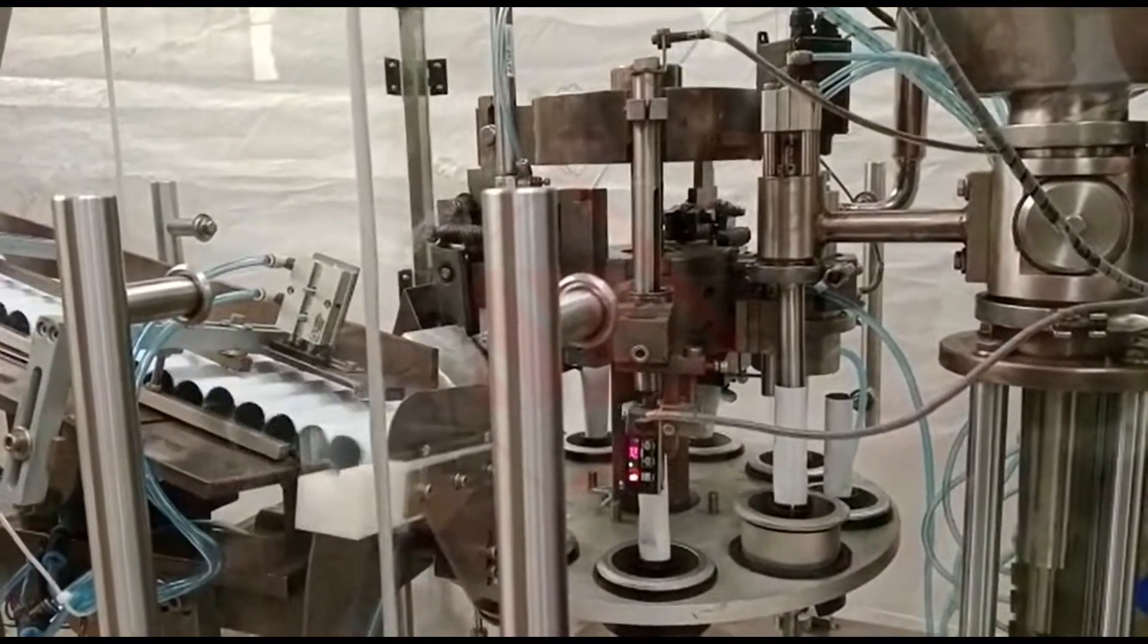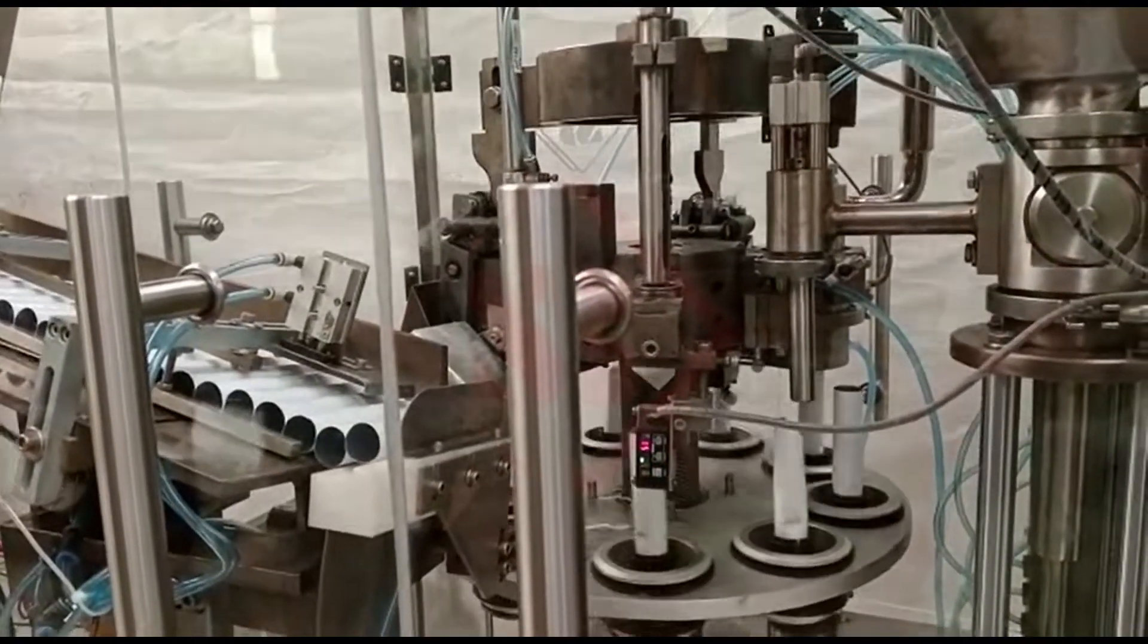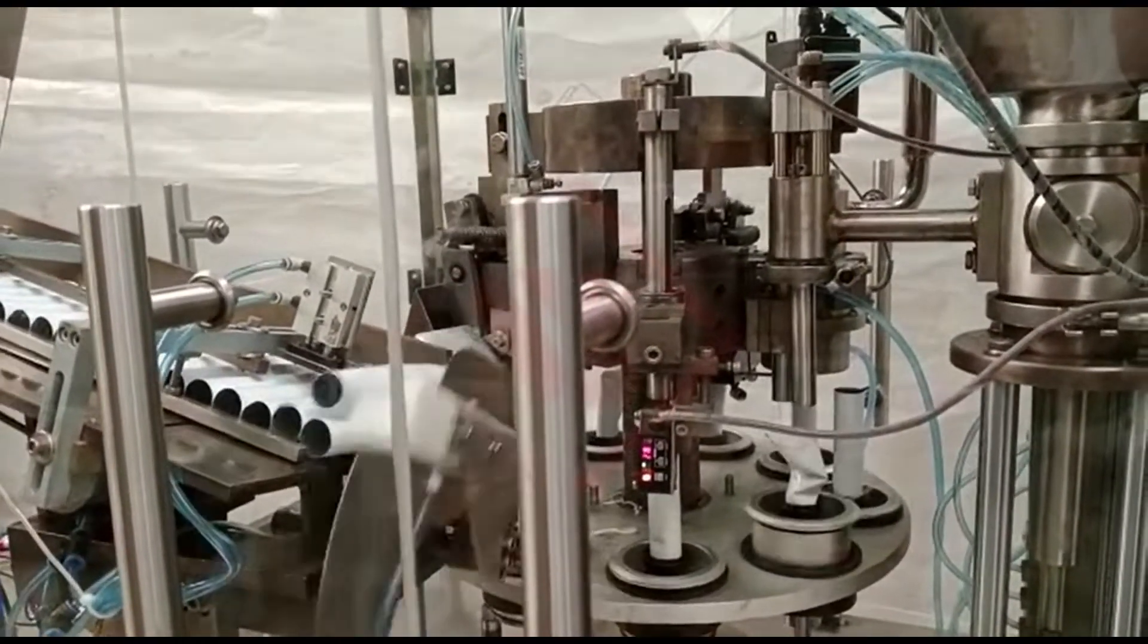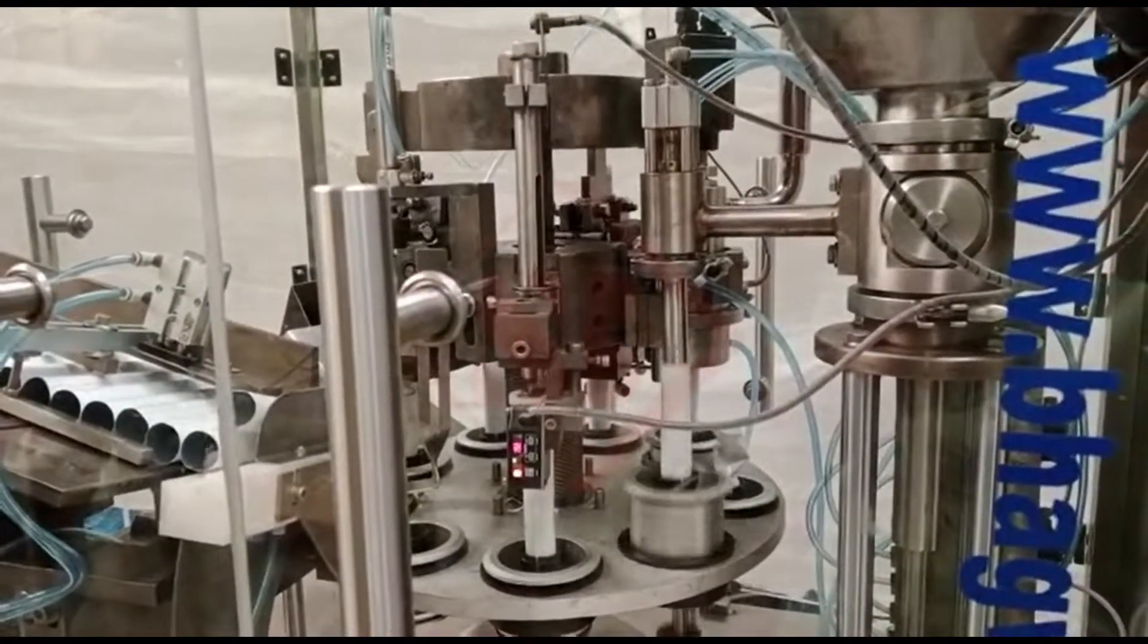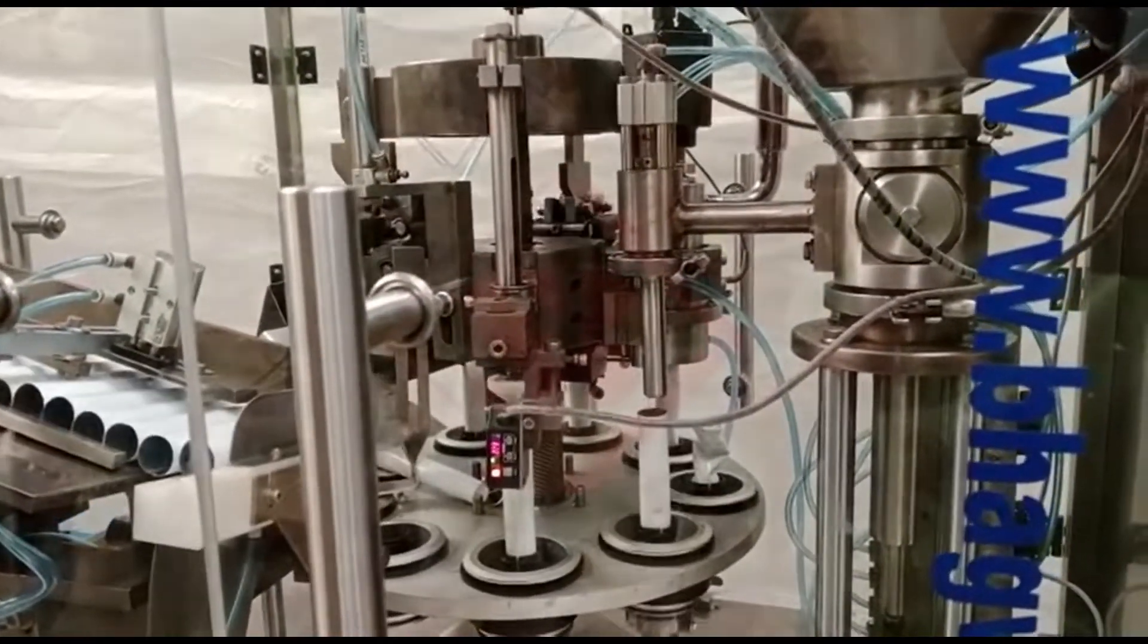Tube Feeding System: This system allows for the continuous supply of empty tubes to the filling station. The tubes are typically stored in a hopper or magazine and fed into the machine one by one.